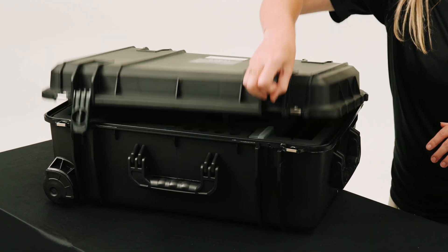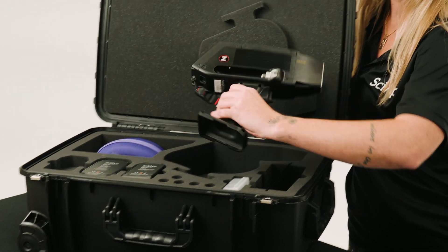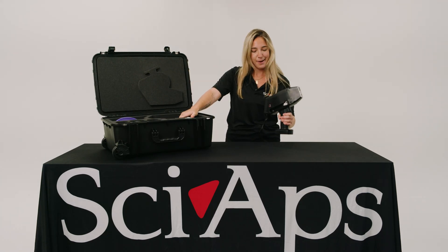This right here is our Z901 Alloy Analyzer. It comes in this very protective Pelican case. Right here is a battery — insert it, turn it on, and I'll show you the rest right now.